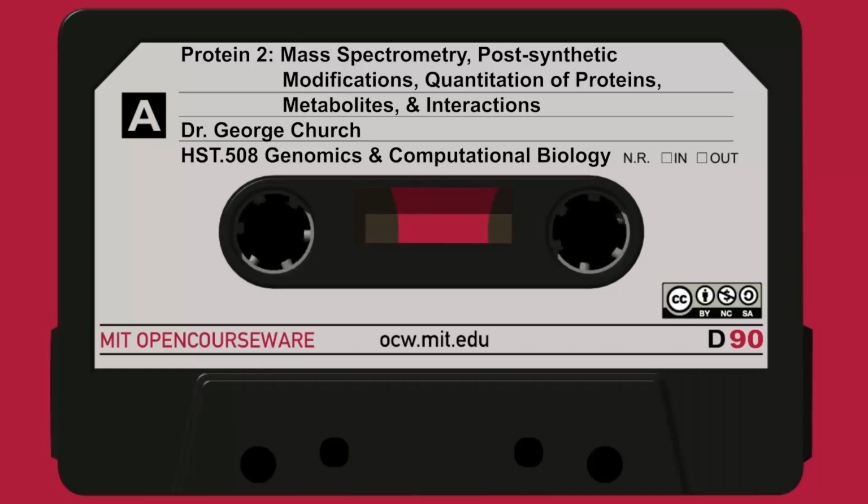Okay, so now we've got these two dimensions pretty well in hand, the reverse phase and the mass. Now we're going to add another dimension, actually a couple more dimensions. One is another peptide dimension, which is strong cation exchange, SCX. What this means is the peptides will have different cationic properties, different charges, and they will bind to different extents to this. And you can put these in tandem, either physically or conceptually. You'll run one, take a bunch of fractions, and then put it on the reverse phase. The reverse phase literally is physically connected to the mass spectrometer.